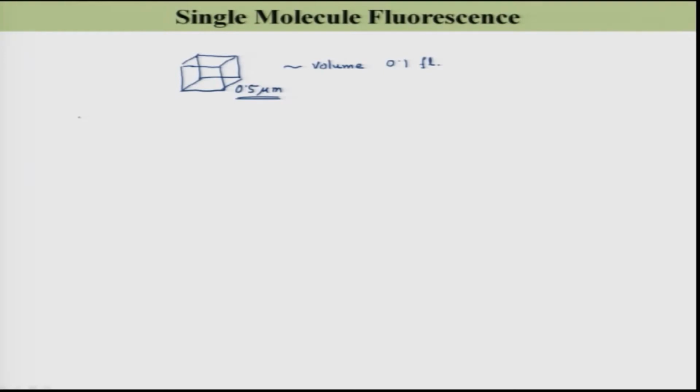The first technique which I will discuss is based on the total internal reflection method.